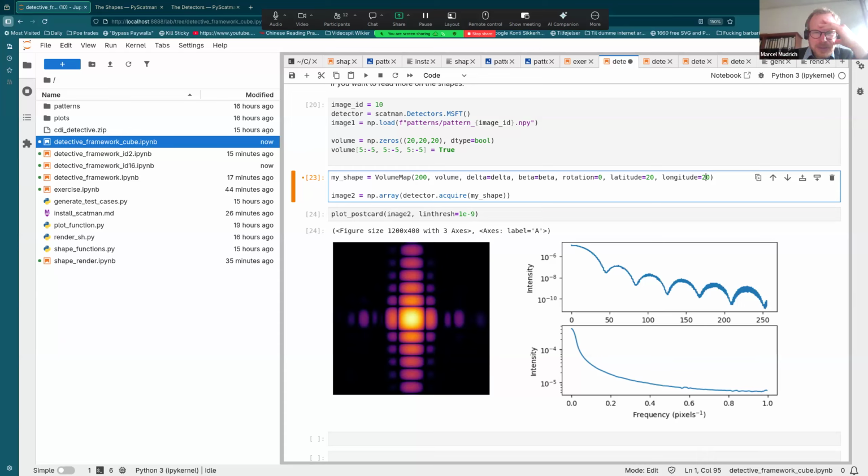The first time I saw this, I found it amazing how this diffraction imaging technique enhances any periodicity, even if the periodicity amounts to just two features. Whenever you have parallel, or ideally even repeated parallel surfaces, this creates a very strongly enhanced elongated streak pattern in the diffraction. So these kinds of shape changes are strongly enhanced.